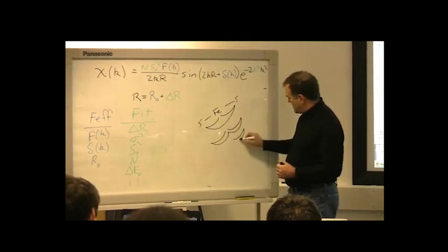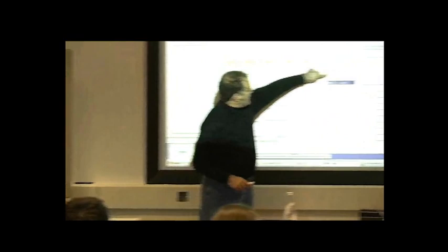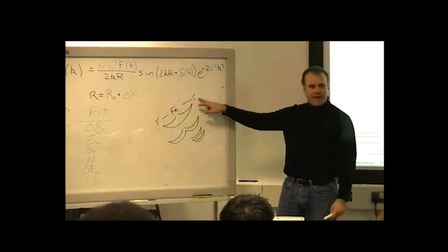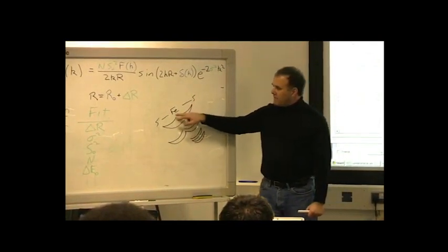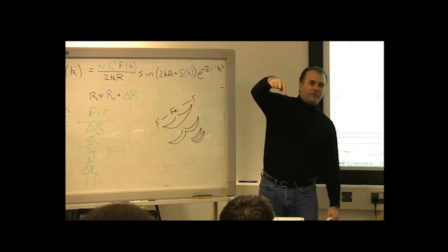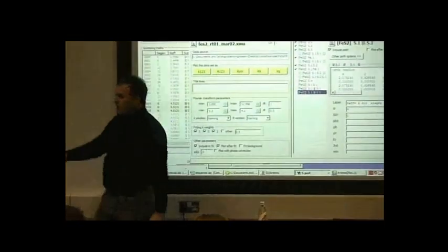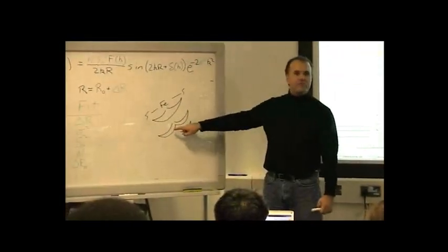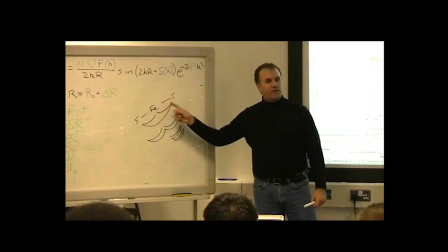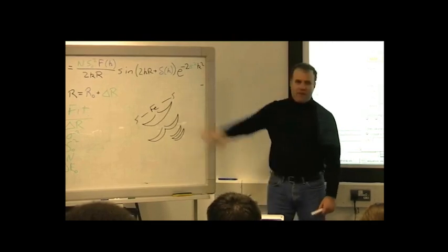and that, right? So one of them, this one here, it turns out, is the path where the photoelectron propagates out, scatters off the sulfur atom, propagates back without scattering off the iron atom, and scatters off the sulfur atom on the other side, and then closes the loop. The next one, this one, does the same thing, except it also scatters in the middle off the iron atom. The last one rattles back and forth between the iron and sulfur atom. It goes boing, boing, boing, boing. So it turns out that these three paths together are what we need to finish off the fit.